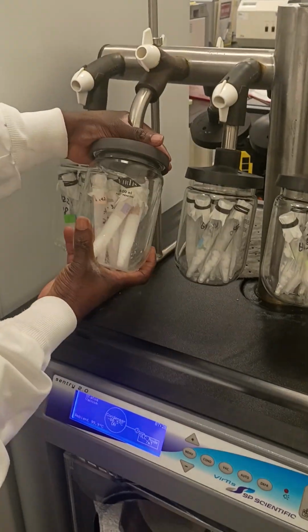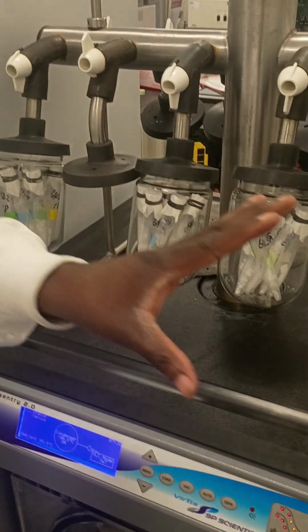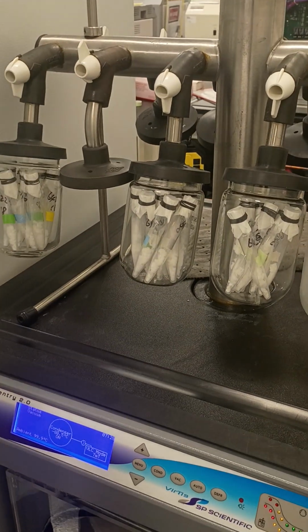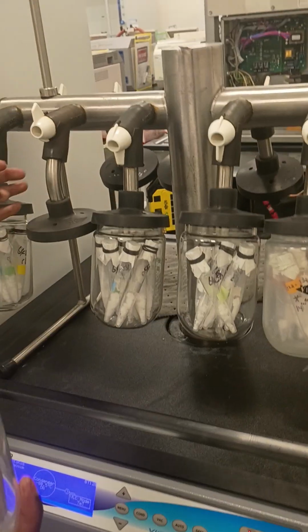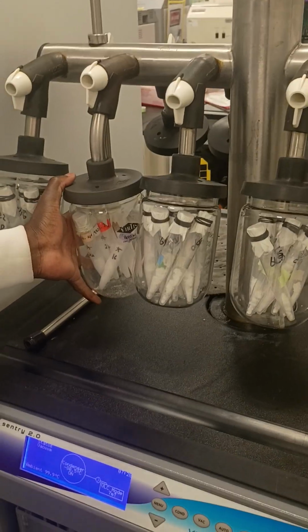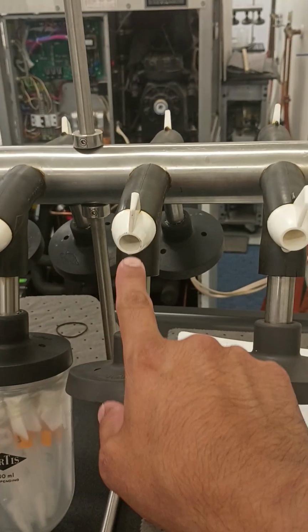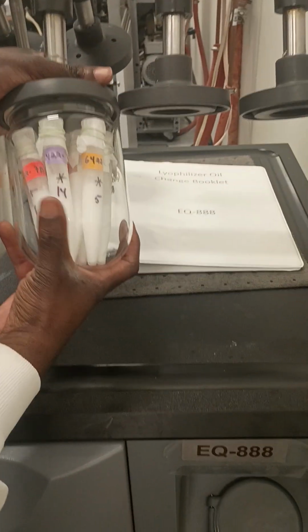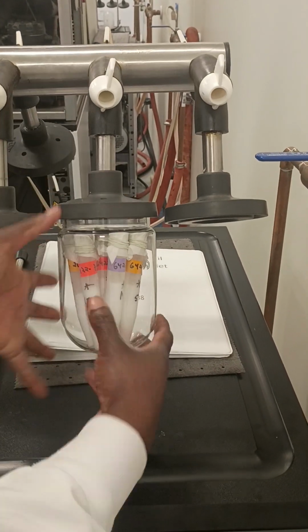So, what we're gonna lyophilize means we put them here in the tree. This is the tree, the conventional one. We've got one here and another one in the back. What I do is put it here, then I seal it. You hear that? That means the vacuum is running through it. This means it's sealed, that's released. So here's what we do: we put it here, then we get this one.